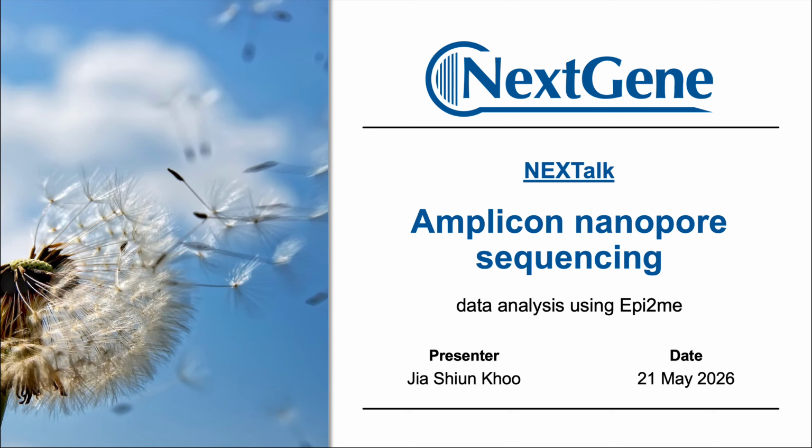Sorry, I think that I saw another question in the chat box. Using EPI2ME, from the results of analysis, can I have an abundance table, something like OTU, ASV, and a taxonomy table? I need this for another analysis. This is actually a question that should go back to the sessions we had last week, but I can give a quick answer on this.